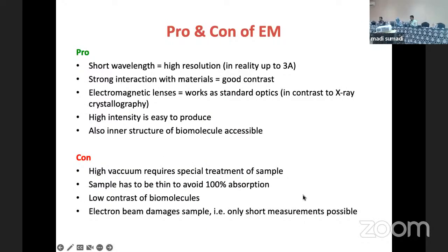So the ultimate view of the scientific structure that you can see is only through electron microscopy, even though we do have other technical developments that are still working wonderfully. But if you want to confirm, you need to do electron microscopy. There is no other alternative. And why? The research, the understanding that we're doing is everything. We do a lot of novel methods, novel techniques, but you do not see the real structure to the eye. The consequences or secondary reactions can be seen by different techniques, but the real structure of a tissue or a cell can be seen only by electron microscopy.